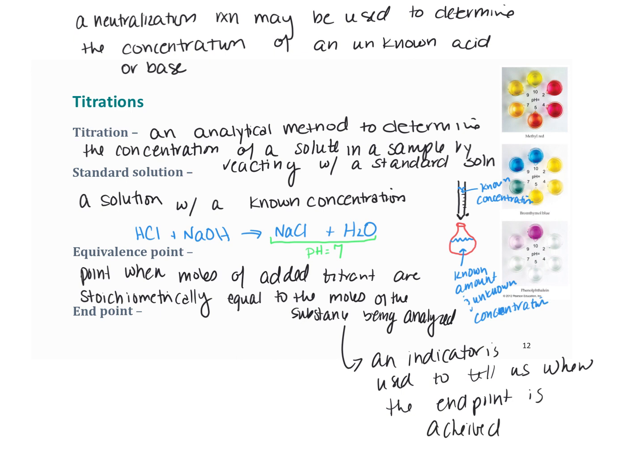And what do I mean by that? Well, this is called phenolphthalein. This is a really well-known indicator. In an acidic solution, phenolphthalein is clear. And then when the solution changes from a pH of 7 to 9, it turns pink.